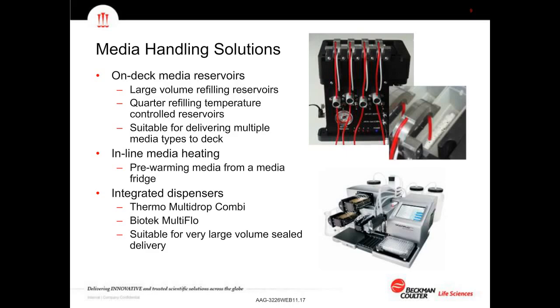Another way, and certainly this isn't all of the ways that we might deliver media, but another very common way is to integrate a dispenser, and typically we use devices like the Thermo Multidrop Combi or the BioTek MultiFlo, which we would integrate directly on the deck of the robot. And these are suitable for delivering one media type, most commonly in a very large volume. One of the advantages of this compared to the refilling reservoir is that the system is typically sealed. So you seal a bottle onto the dispenser, and then that doesn't get exposed to the environment until it travels out of the nozzles into the plate.